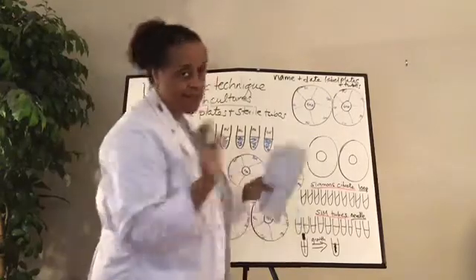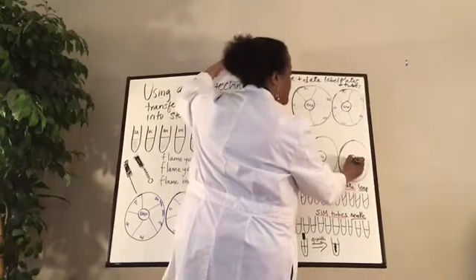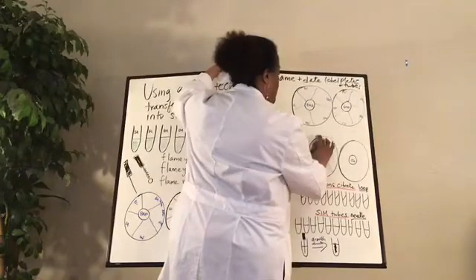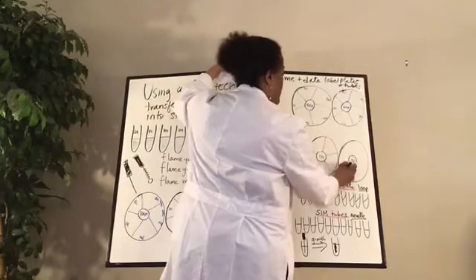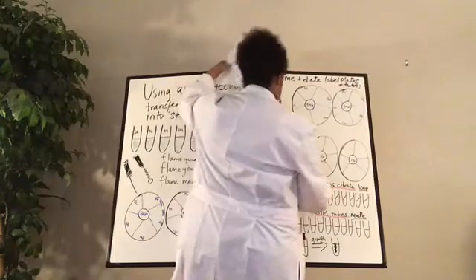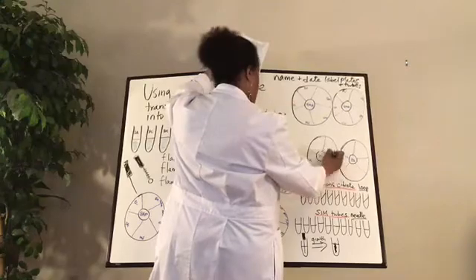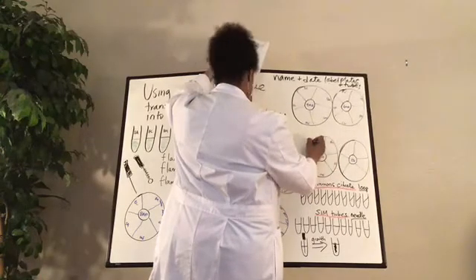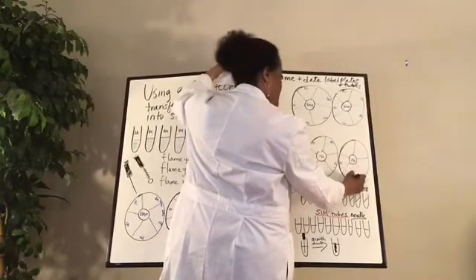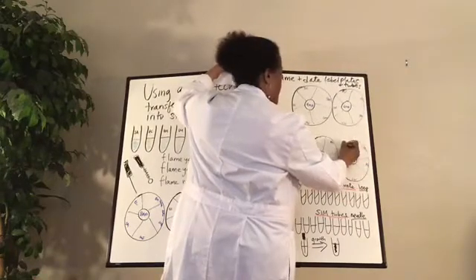This is a TSA. Just about everything goes on TSA, but we must label it so you'll know which plate this is. And let's just go on and make our wells here. All right, let's label it SA, MS, SM. Keep it just like this. And EC, I want it all organized exactly the way it is on this board. I mean, as far as the bacteria is labeled.